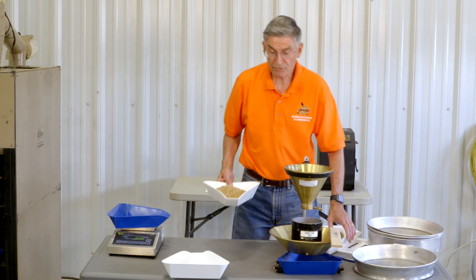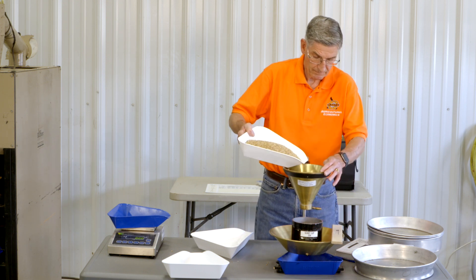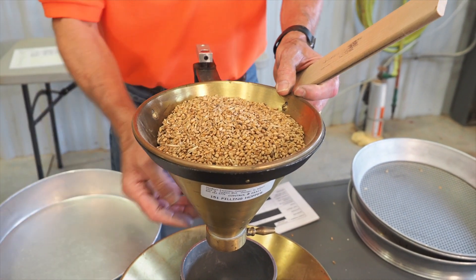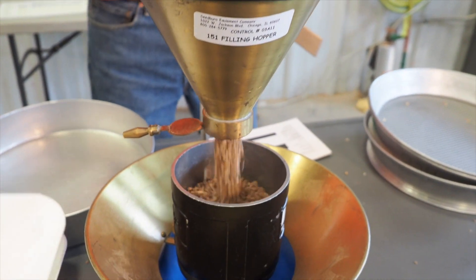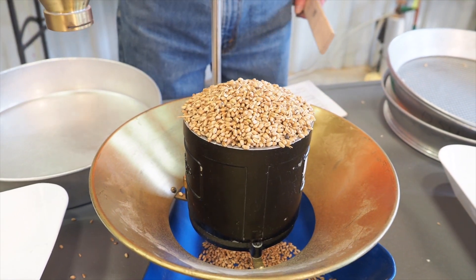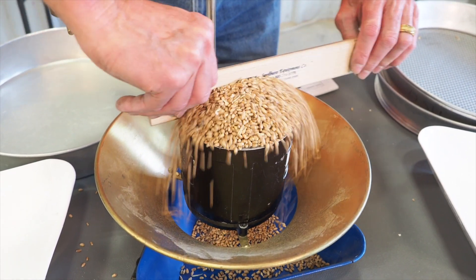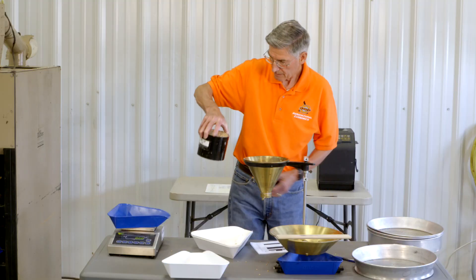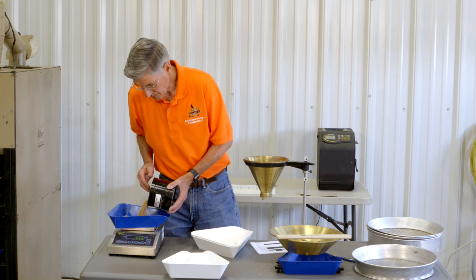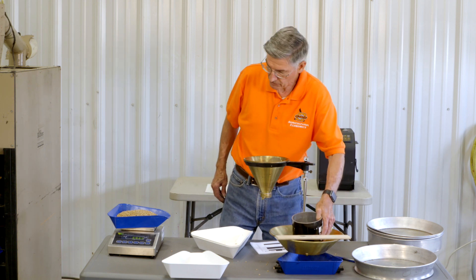Now I can take my dockage-free wheat and calculate the test weight. Three zigzag motions, striker straight up and down. One pound — pounds per bushel — and I have 59.4 pound test weight wheat.